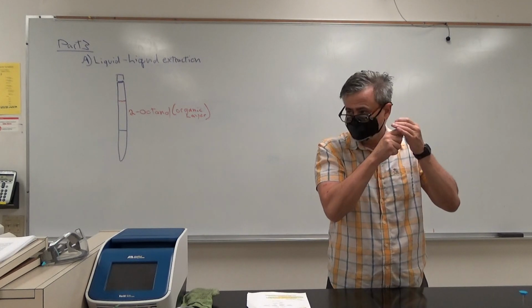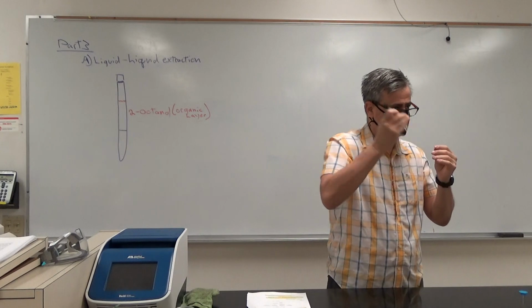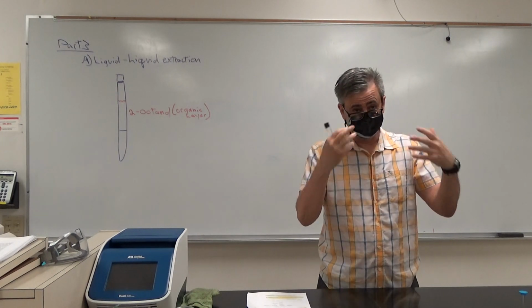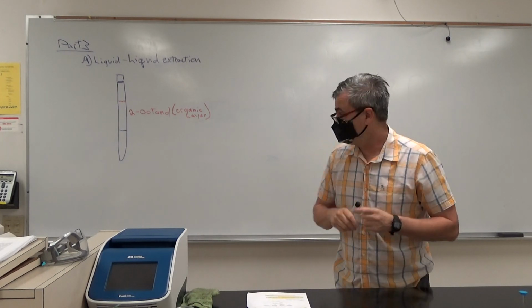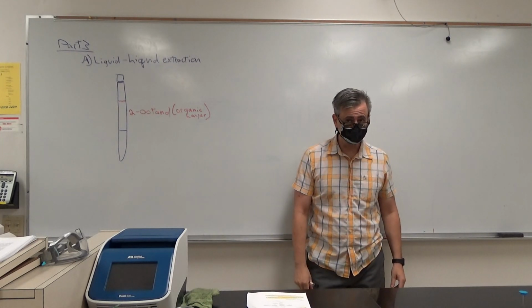All right, okay, no, that's okay, I can be a little bit more aggressive. Get it shaken up for you, okay? When you do that, some of that methyl violet is actually going to go into the 2-octanol. Okay?